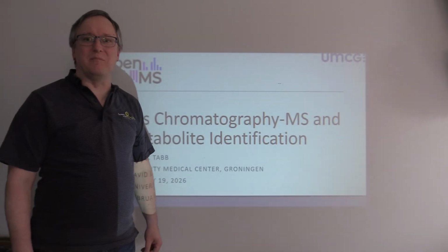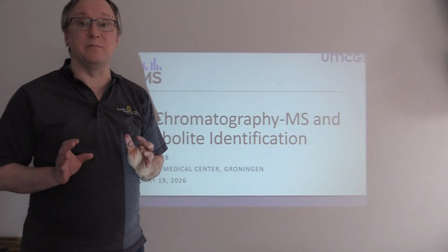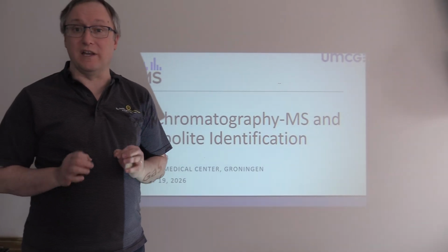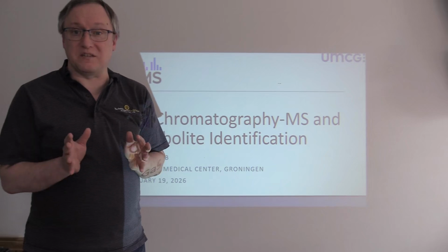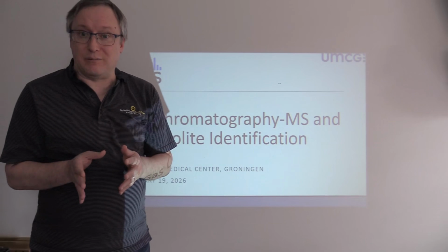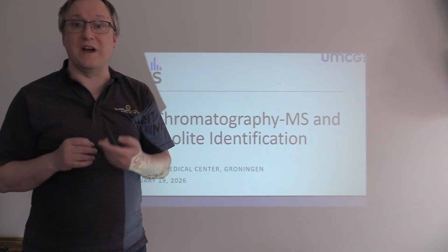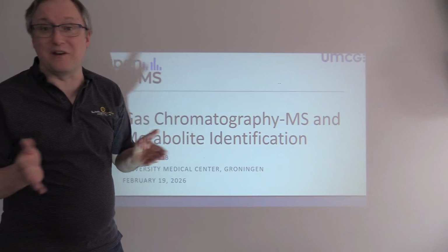Hello, I'm Dave Tabb, and today I'd like to take you on a quick walk through some essentials in metabolomics. Specifically, how do we generate tandem mass spectra, or very energetic mass spectra, from metabolites, and then how do we interpret them, how do we match them to identities, and perhaps even quantify them.